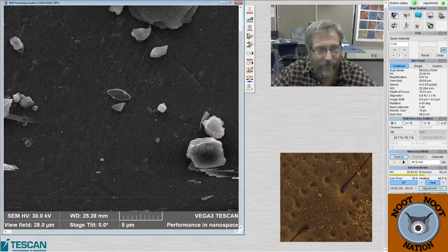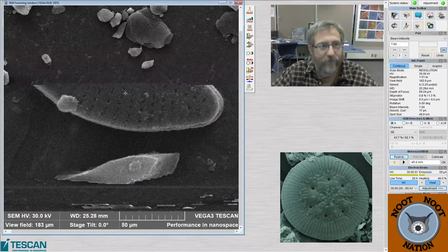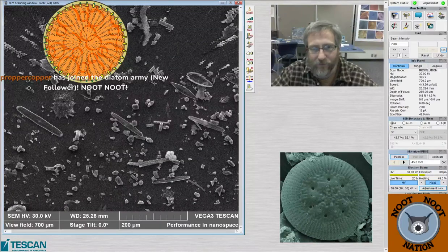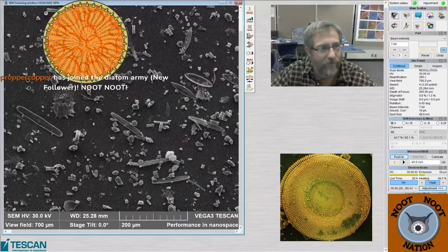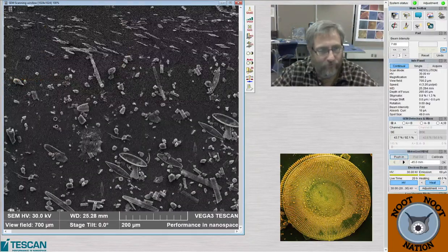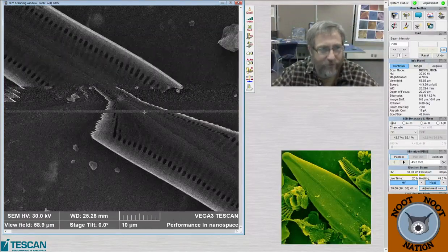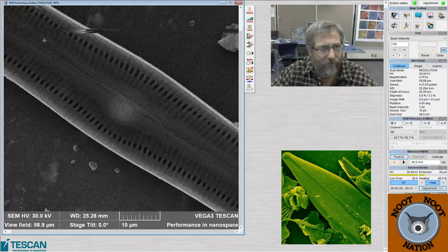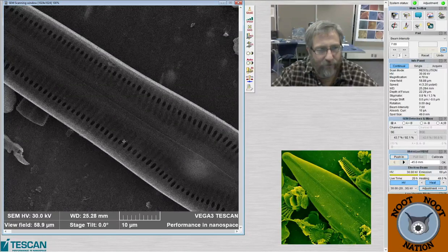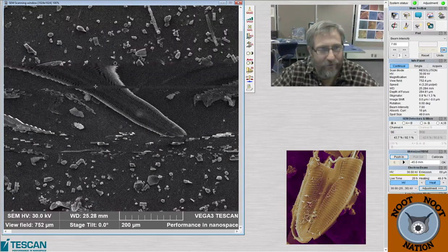This is Cervarella, I believe. Yeah. I haven't seen any of those. Other side of the valves though. What's this? We'll get a close look at this Pinnularia. It's got like a giant silica plate covering over the middle part. And all the cool stuff is hiding behind it.